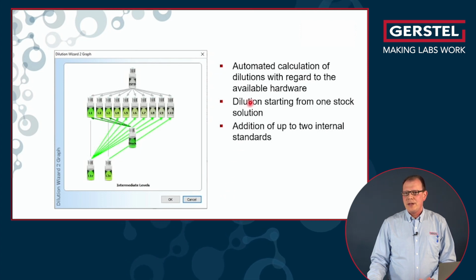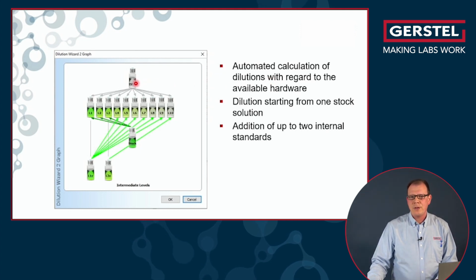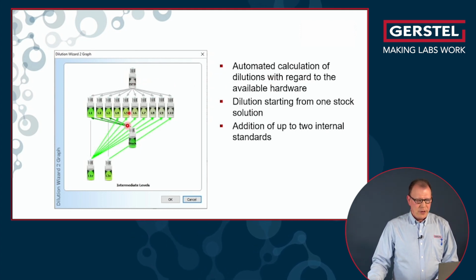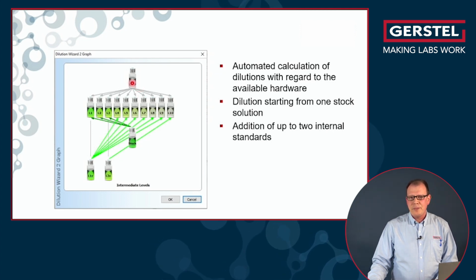As I said, Maestro calculates every dilution with regard to the available hardware. Dilution always starts from a stock solution here on the top. Oh no, this is the internal standard, the stock solution is here. And we also have the possibility to use up to 2 internal standards if this is needed.